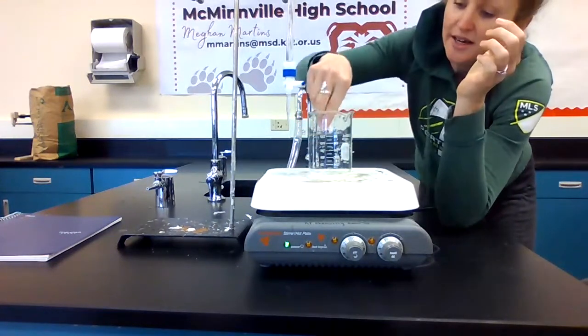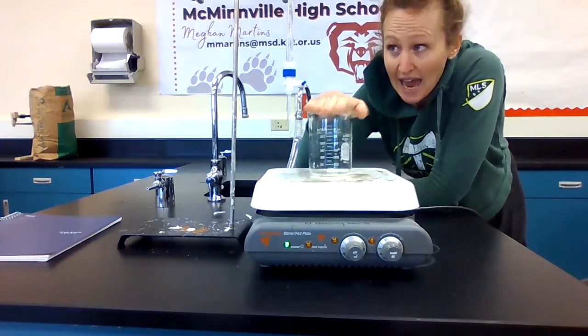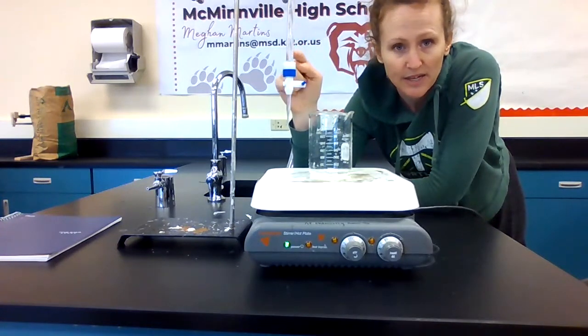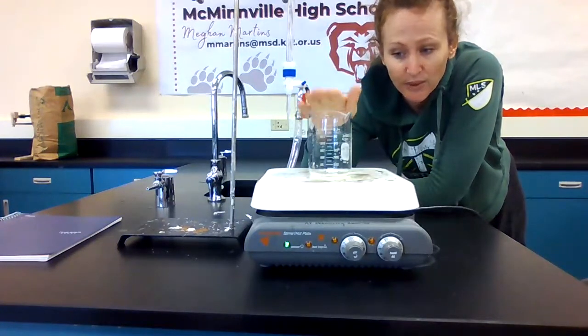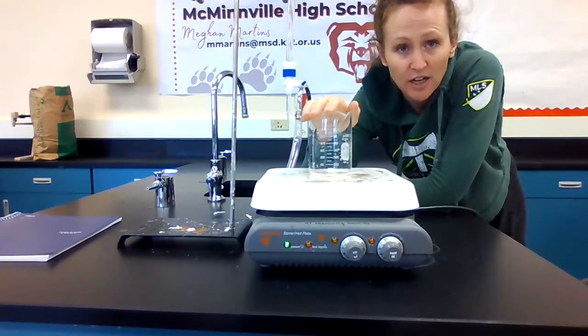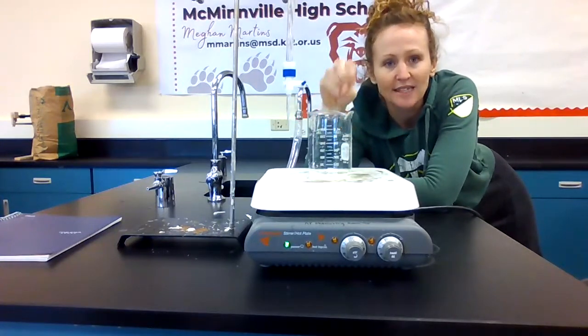A nice thing about having a stir plate and a magnetic stir bar is that it will mix the solution for you. What we're doing today is taking an acid and adding in, very slowly, a base. We're going to get a reaction that occurs in this beaker, and we want the reaction to occur throughout the solution at the same time, so stirring helps.